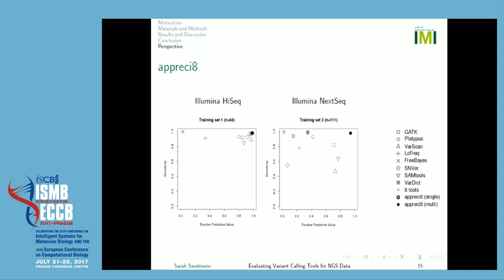And then it's important to see the black dot in the upper right corner. This is actually Appreciate, our pipeline, and you can see it has really high sensitivity and nearly perfect positive predictive value, and it clearly outperforms all the individual tools. Okay, it's just the training set.